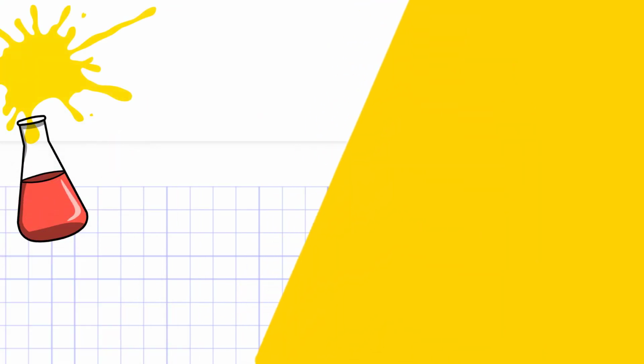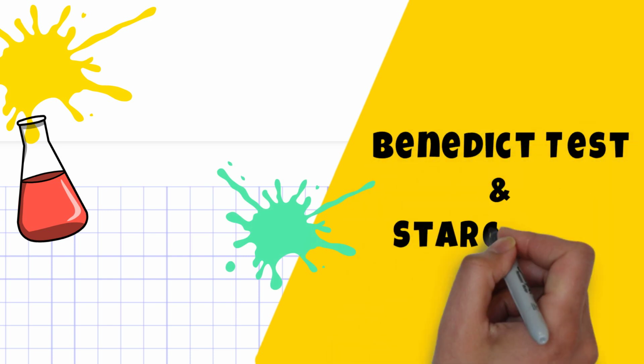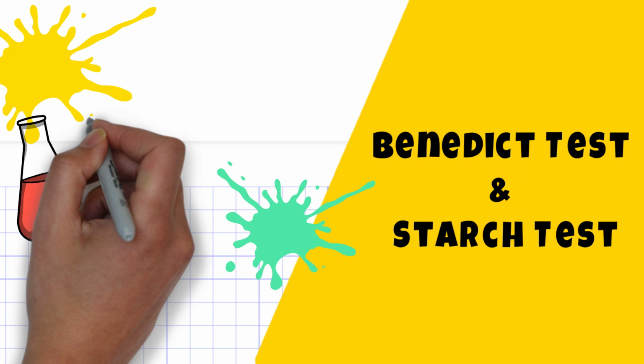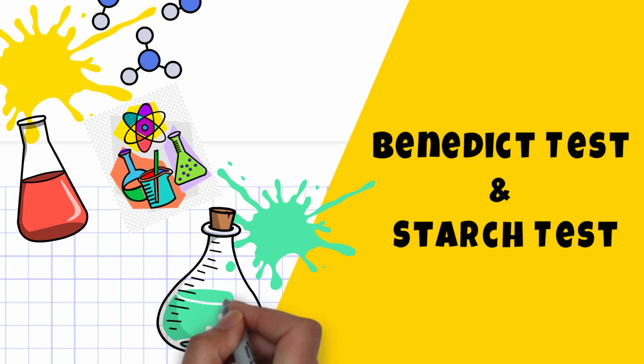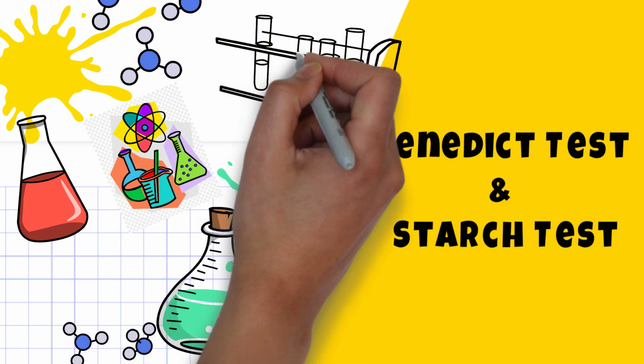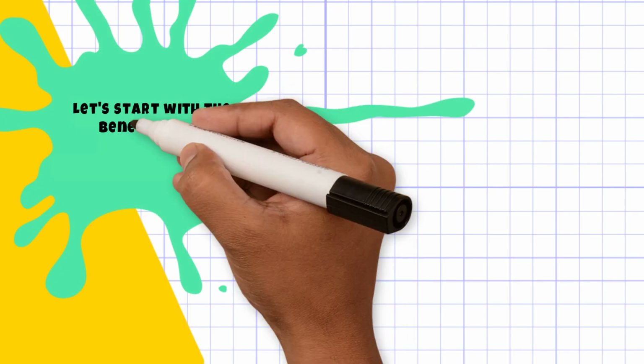Today, we're diving into the fascinating world of biochemical tests, specifically focusing on the Benedict Test and the Starch Test. These tests are essential in the field of biochemistry, helping us identify the presence or absence of certain compounds in various substances. Let's start with the Benedict Test.